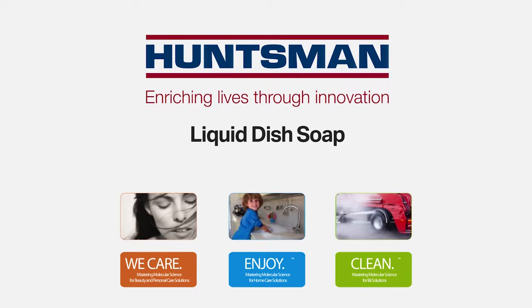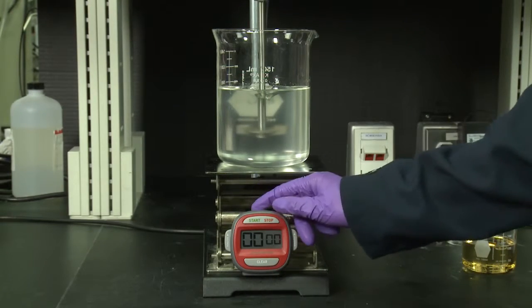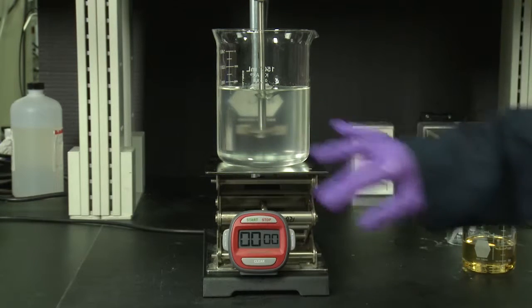Today we're going to use Sirphonic VBS C10 to prepare a liquid dish soap formulation. The components of today's formulation will be a pre-mix consisting of water, triethanolamine, Natrosol 250-HHR, which is our hydroxyethyl cellulose.